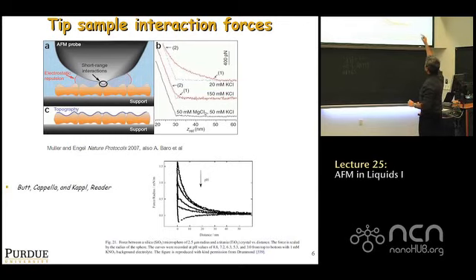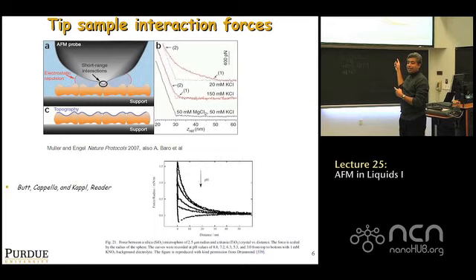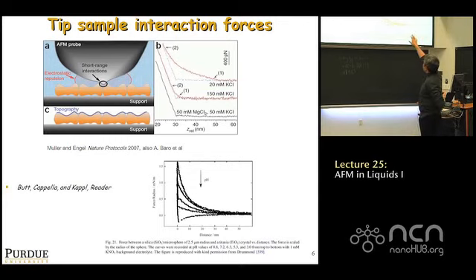As you increase the salt concentration, you find that the Debye length, i.e. the length over which you feel the repulsive force, starts shrinking. And in this particular experiment, at the highest salt concentration, and of course, this depends on the valency of the ions there. Magnesium is not the same as potassium and so on. And so all this you have to take into account. The key point is when you choose a 50 millimolar magnesium chloride and potassium chloride, you effectively have screened the electrostatic forces completely. And the cantilever feels no force until it touches. And then repulsive force comes in.